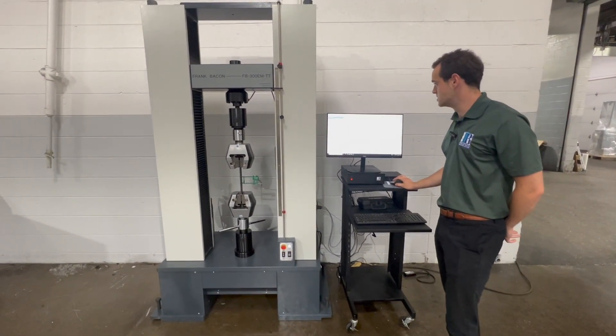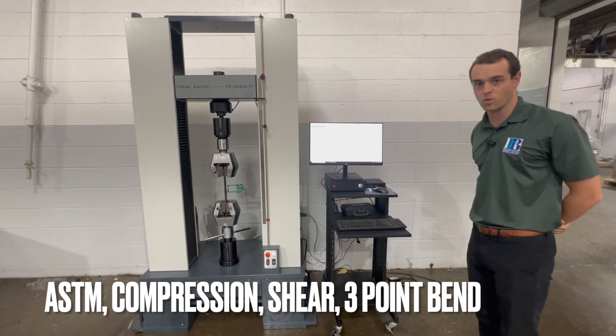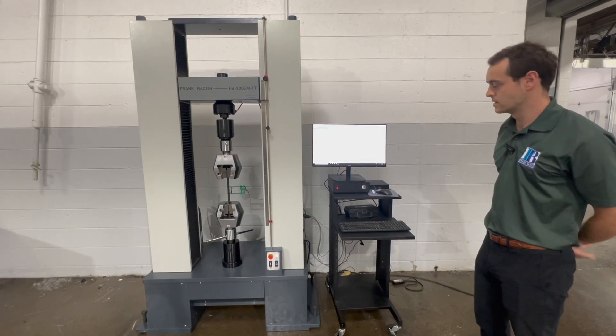But the machine can do a variety of other tests — anything in compression, shear, three-point bending. There are thousands of ASTMs out there.